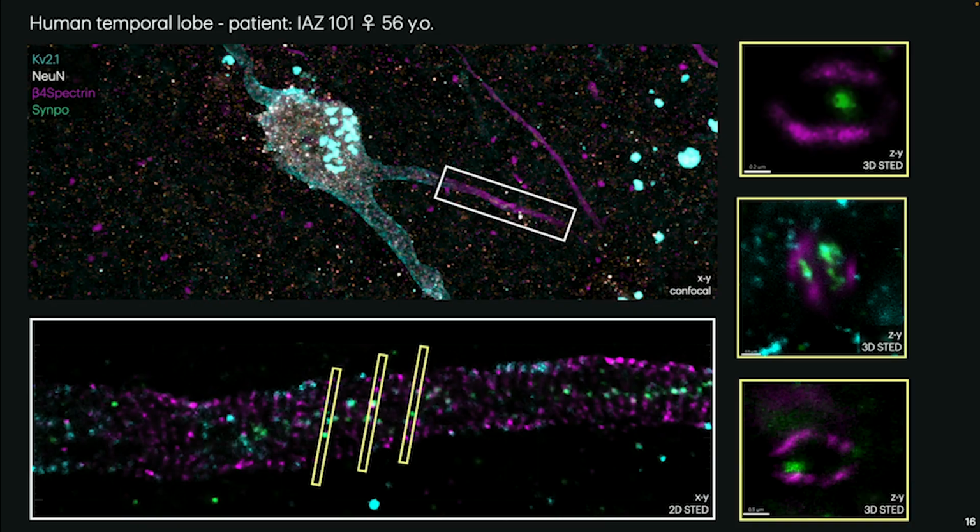Because as you can see in the upper picture on the right hand side, the cisternal organelles tend to oftentimes be quite central inside the axonal structure, but they are always moved way closer to the outer membrane whenever there's a contact site with ion channels or with other structural proteins that are on the outside of the AIS.